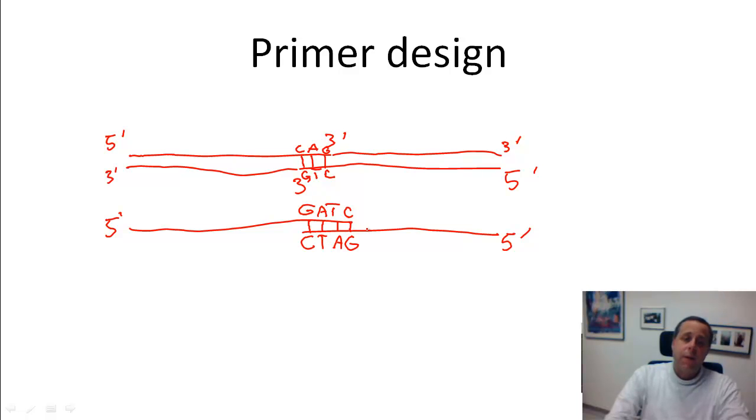So two copies of the same primer will dimerize again in that way, will anneal to each other and will then be filled, and this again will compete with the real PCR product that you want to get. So that's something that you need to avoid, and if accidentally it happened to you, just throw them away and get new primers because otherwise the reaction won't work properly.